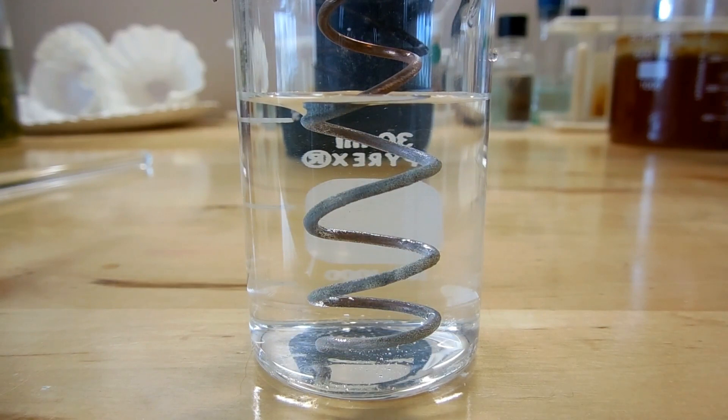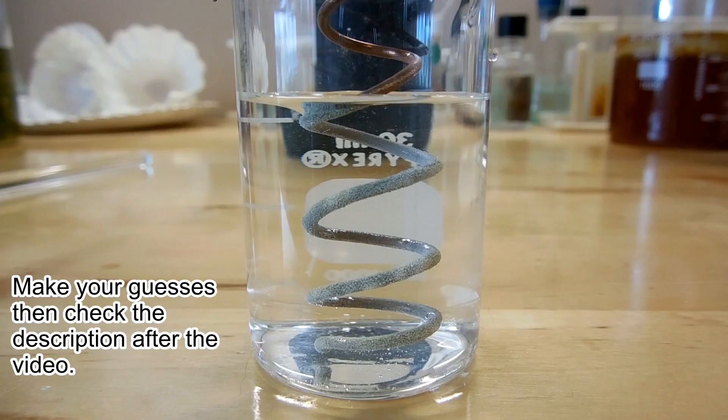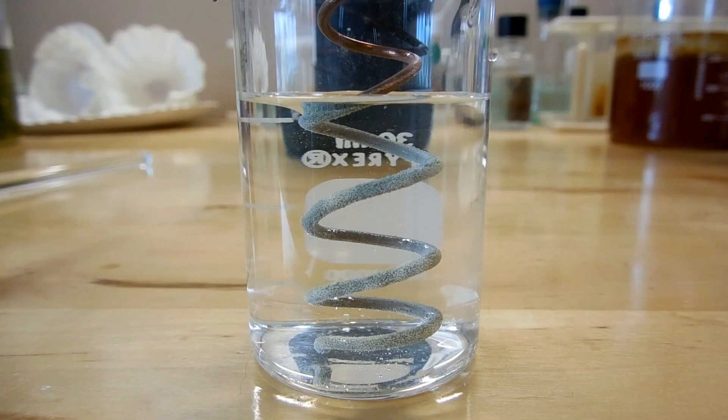You can see almost immediately we get a change starting to happen. The copper wire has started to tarnish — maybe it has a bit of a bluish-white color to it now. And I can already see there's little bits of something growing on it. It looks like fuzz — it looks like the coil of copper is starting to get fuzzy.